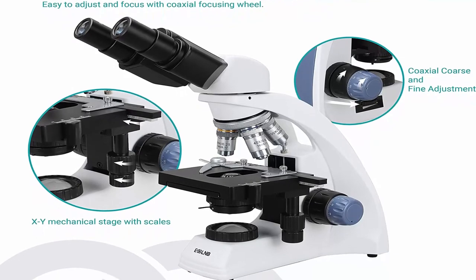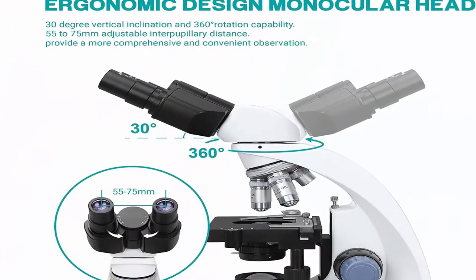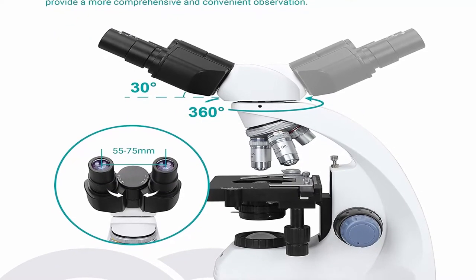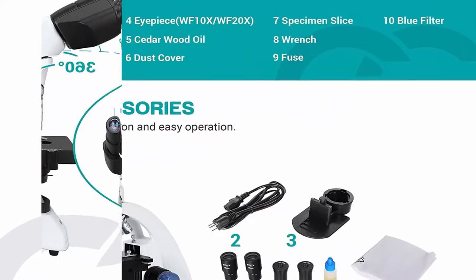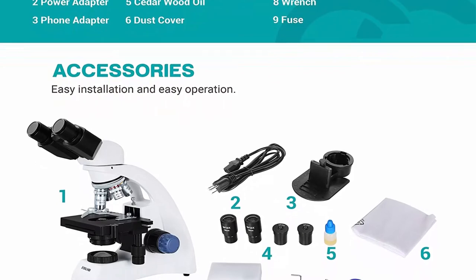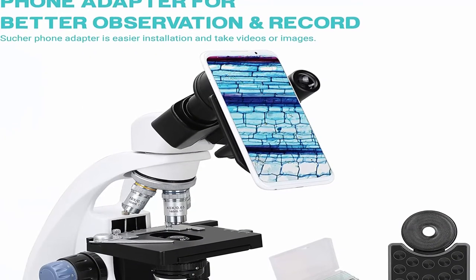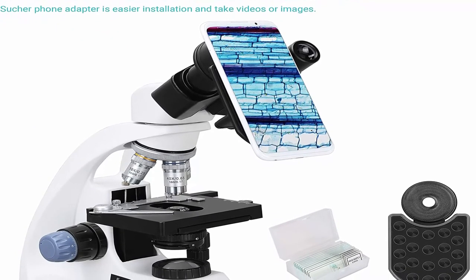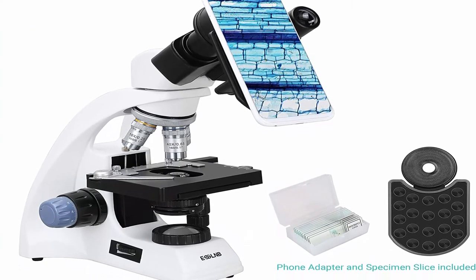3W LED brightfield illumination allows the specimen to absorb light, resulting in a dark image on a light background. Lower brightfield illumination transmits light up through the specimen for enhanced visibility of translucent and transparent objects. NA 1.25 Abbe condenser and iris diaphragm provide good lighting conditions and a brighter field. Compound binocular microscope with phone adapter lets you record and acquire knowledge in the micro world. Microscope slides help you explore tiny things. Blue filter allows different levels of light control. Immersion oil increases resolution of the oil lens.